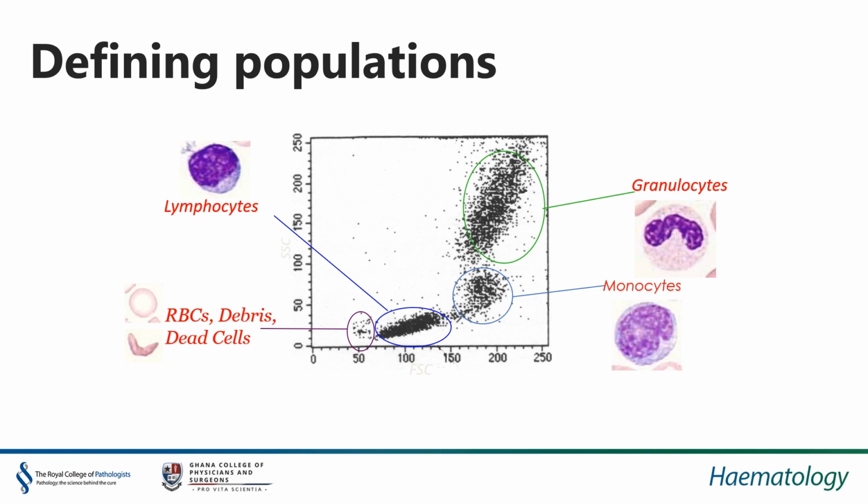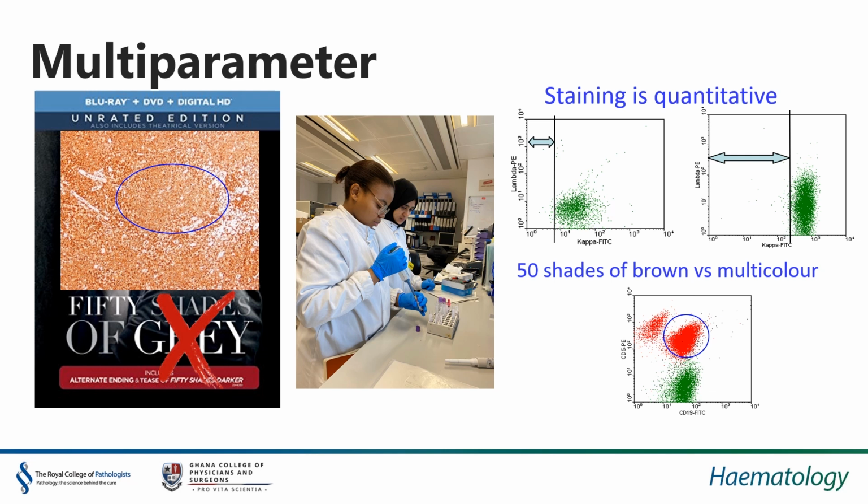heterogeneous group of cells. So flow cytometry is also truly considered multi-parameter, and this is further enhanced by the staining of cellular populations to clearly define and enumerate them within this heterogeneous population. So you can see here we've got some immunohistochemistry on the left-hand side, and it's been stained, and you can see whatever it is, it's positive, very strongly positive. You've got lots of brown stain going on there. In flow cytometry, we can stain cells with, say, 8, 10, 12, 15, 20 colors at any one time to actually tell us in depth what these cells are.